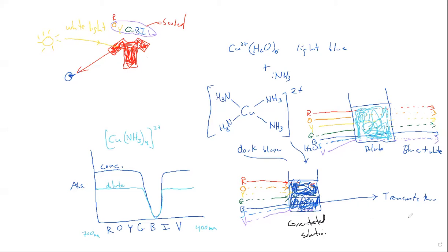Now, go to the page. So the spectrophotometer, you're going to shine light, and I think it says incident light. So this refers to incident light onto your sample. The light that is shined in is compared to the light that is transmitted through and hits your detector.